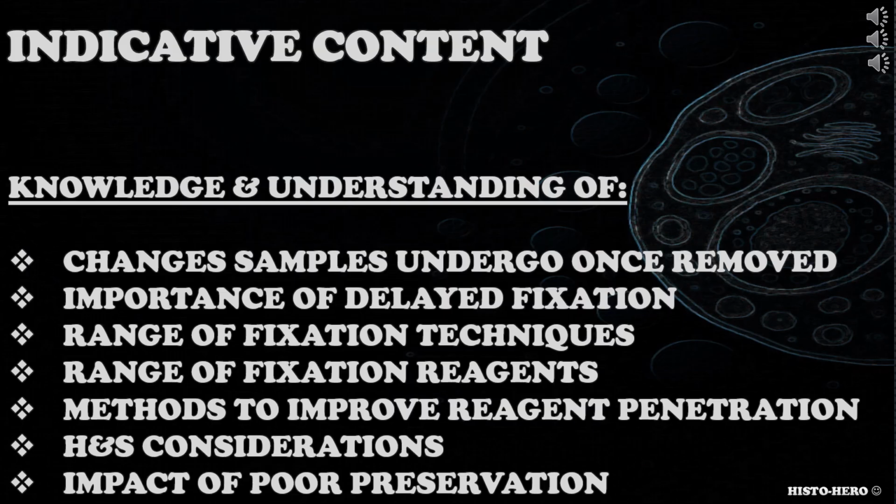Relevant to different fixation techniques and how these can be applied to tissue samples. What fixation techniques can be used? Consider heat, immersion, perfusion, microwave, freezing, vapor.